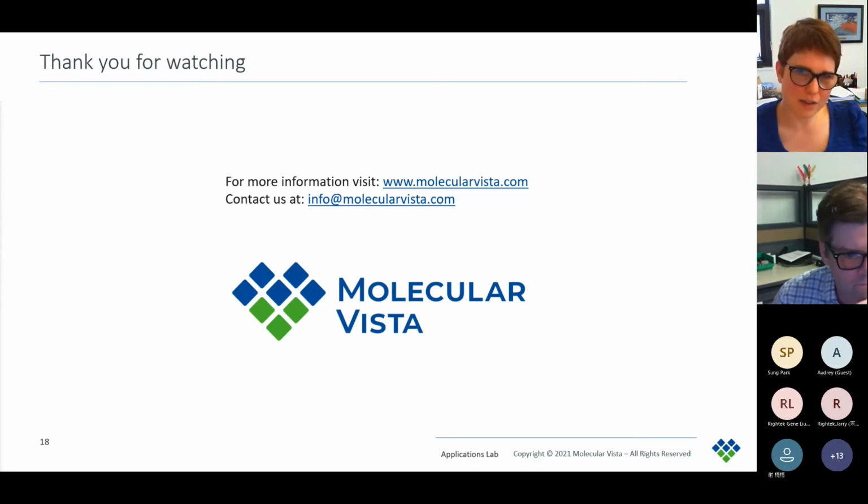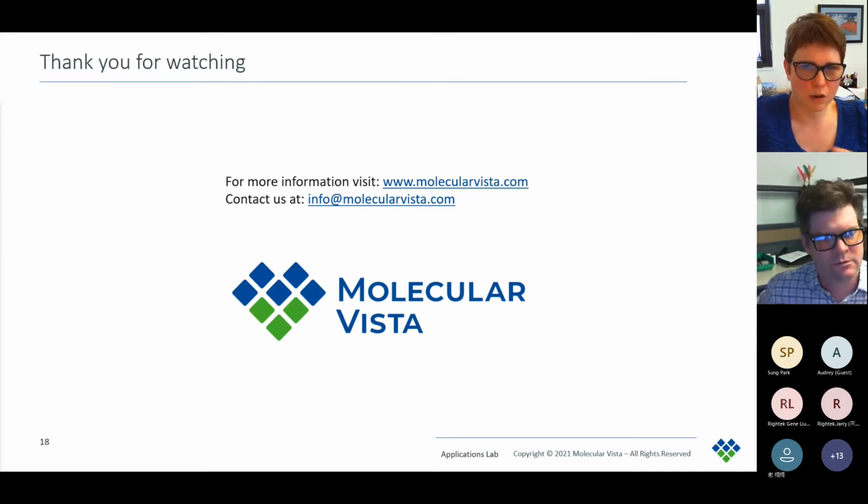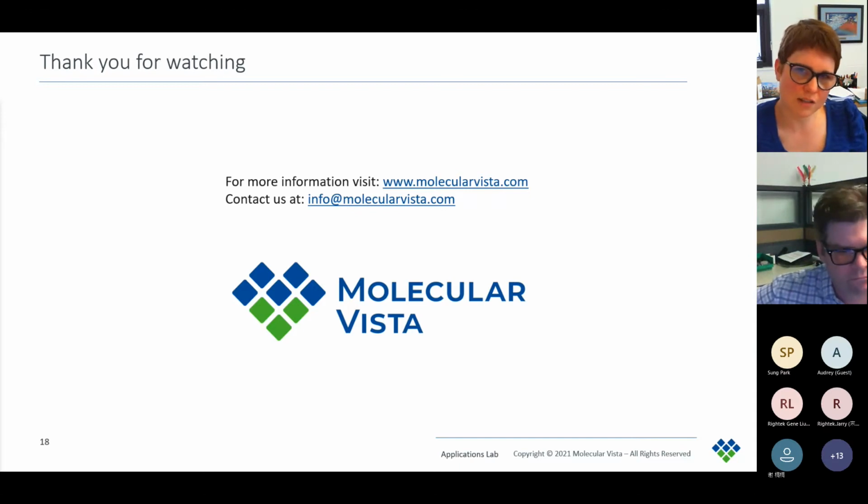So far I haven't tried this for the biominerals yet, because I've heard from a lot of people that it's difficult for these composite materials, because the organic is soft whereas the mineral is hard for the microtome, and this difference in hardness can introduce some damage at the nanoscale. That's why I never tried this, but it would be nice to compare a few different ways to prepare samples and see which one is the best way to move forward.